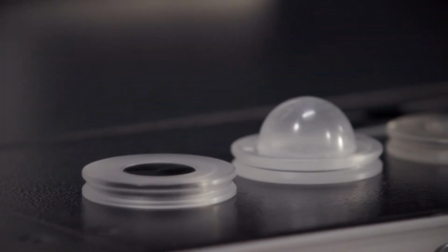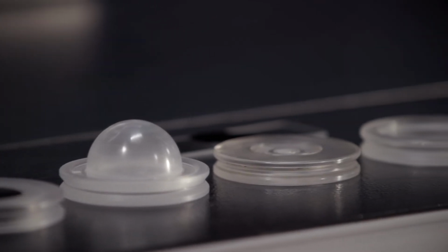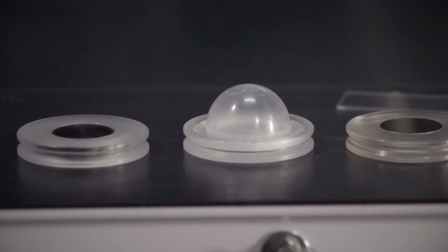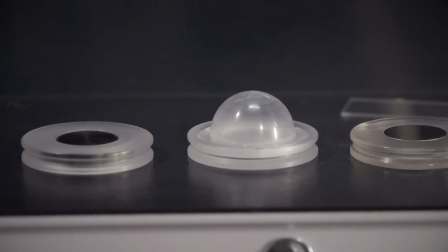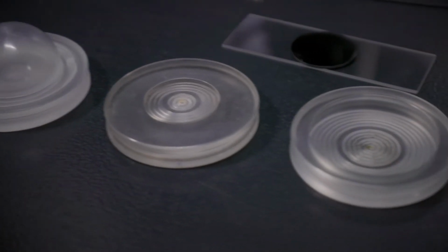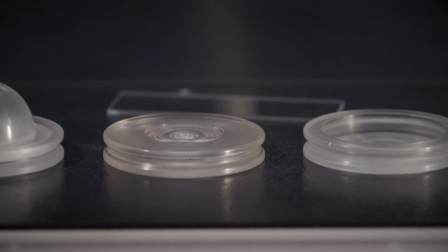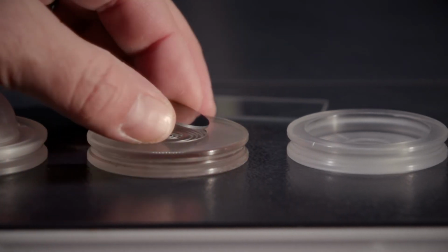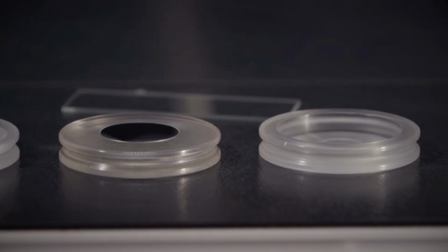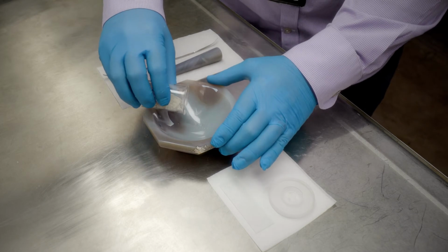Bruker has a choice of sample holders, from standard depth to deep well to allow for larger, irregularly shaped samples, to specific air-free sample holders with beryllium windows. Users are provided with access to the basic standard depth and deep well sample holders for use. Zero diffraction slides may be purchased that fit into the standard depth sample holder to allow for qualitative analysis of smaller sample volumes. Always wear gloves to prepare your samples.